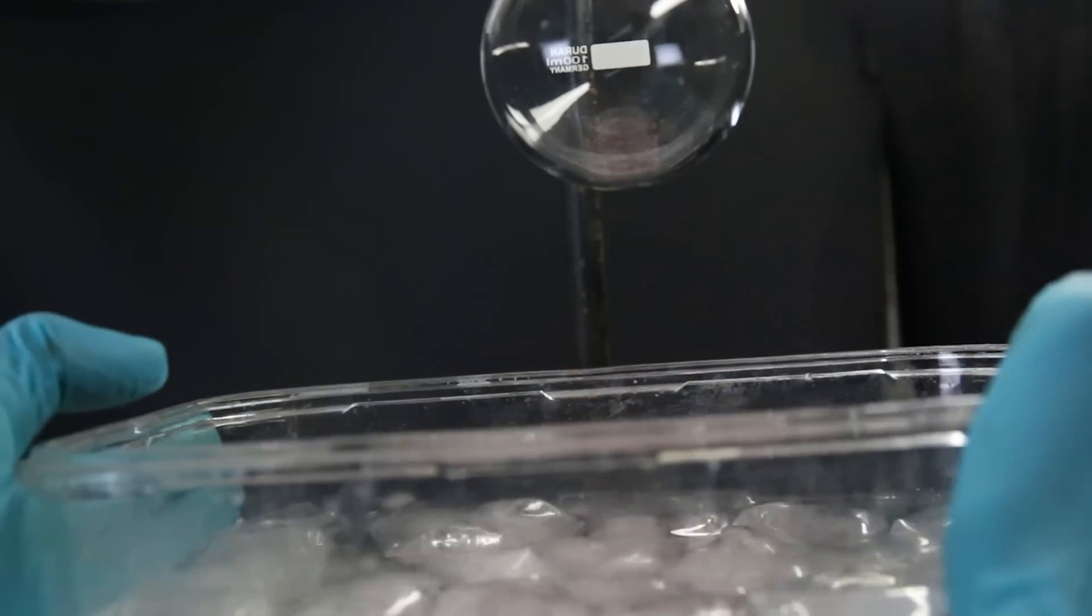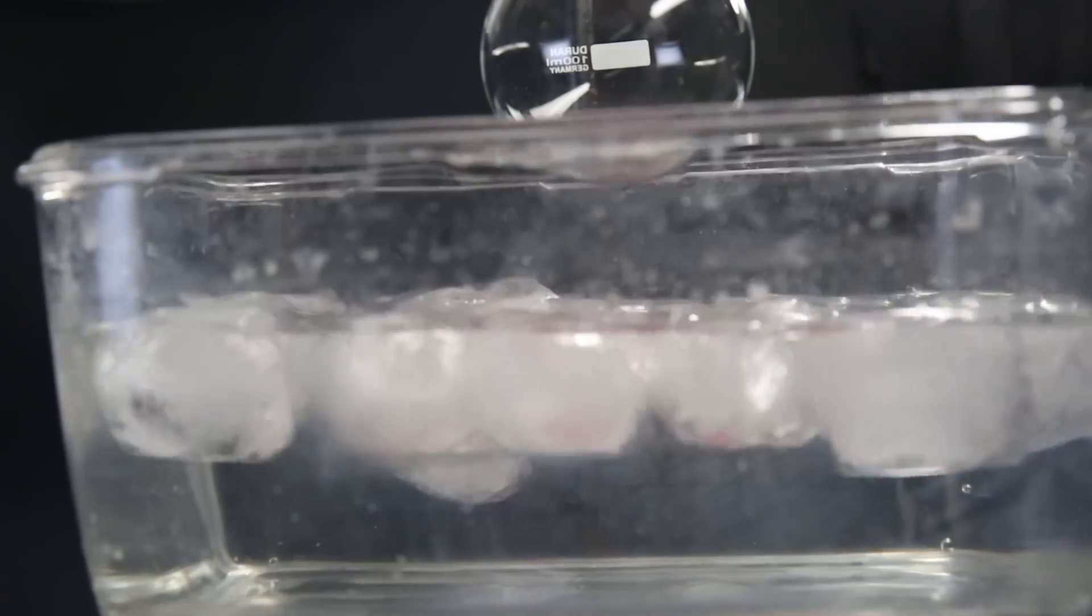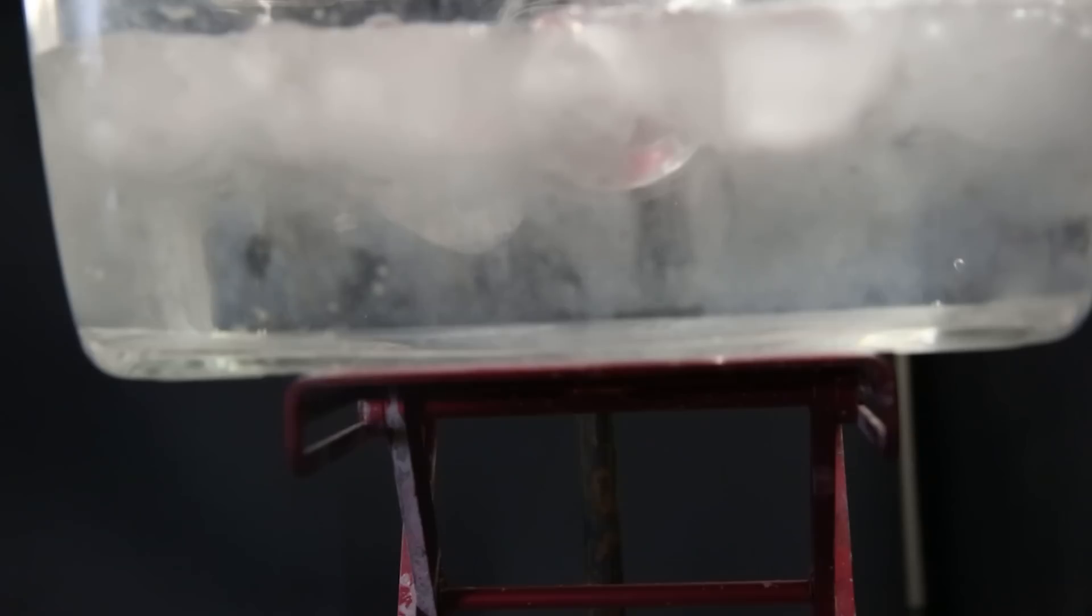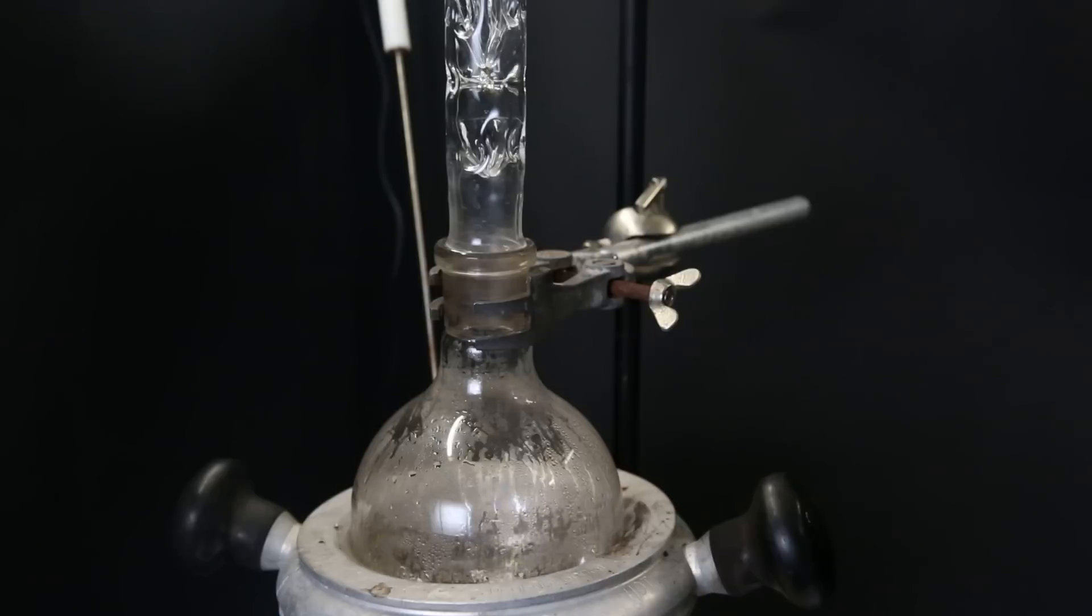Since the cyclopentadiene wants to turn back into dicyclopentadiene at room temperature, I add an ice bath under the receiving flask to prevent this as much as possible. Now to start the cracking process, I simply heat the mixture to a boil and wait for the cyclopentadiene to come over.